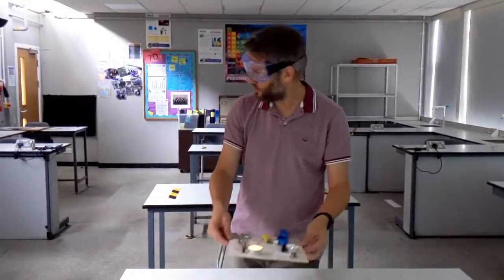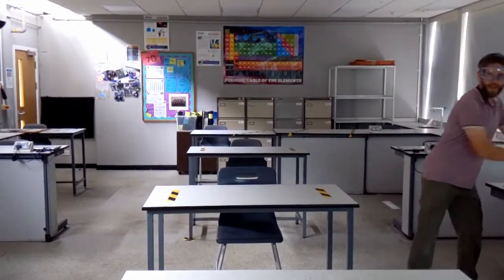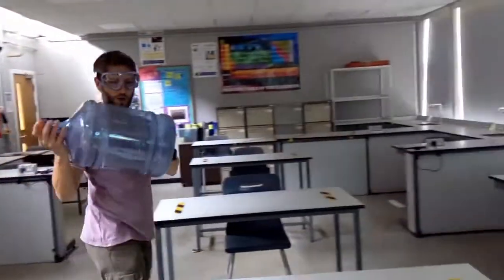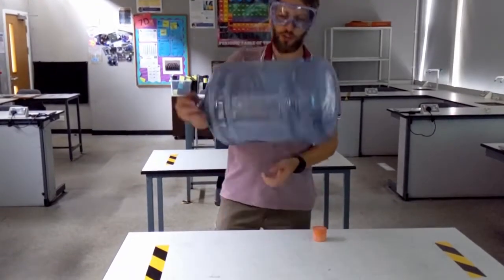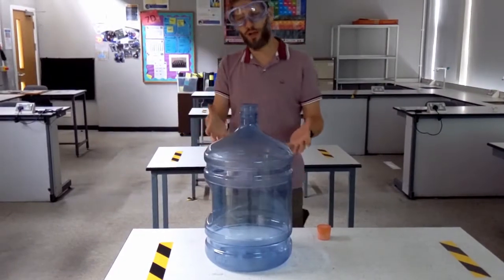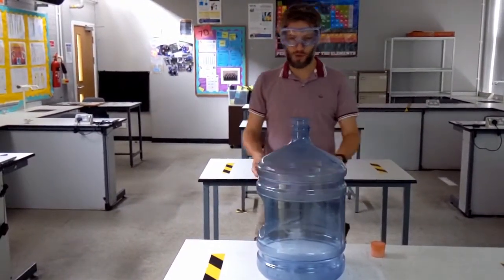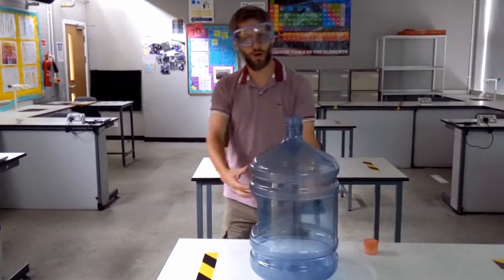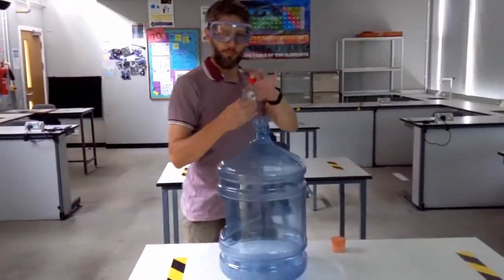I'm just going to move this out of the way over here. And I'm going to get this. So we've got a nice big plastic bottle here, a water bottle that you get from a water fountain. And we're going to put a little bit of fuel in it. We're just going to see what effect that might have when we burn it. Obviously we've got quite a small opening at the top, but quite a big volume, so we'll see what that does. So I've got something called propanol.